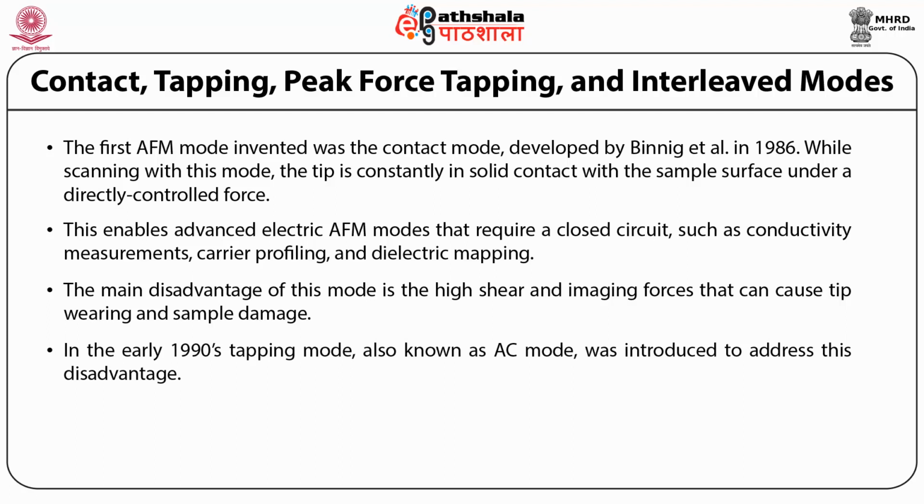In the early 1990s, tapping mode, also known as AC mode, was introduced to address this disadvantage. Tapping mode relies on the mechanical resonance of the cantilever during imaging. The cantilever oscillates at near resonance frequencies, while the tip either only intermittently contacts the sample surface or never contacts it in non-contact mode.